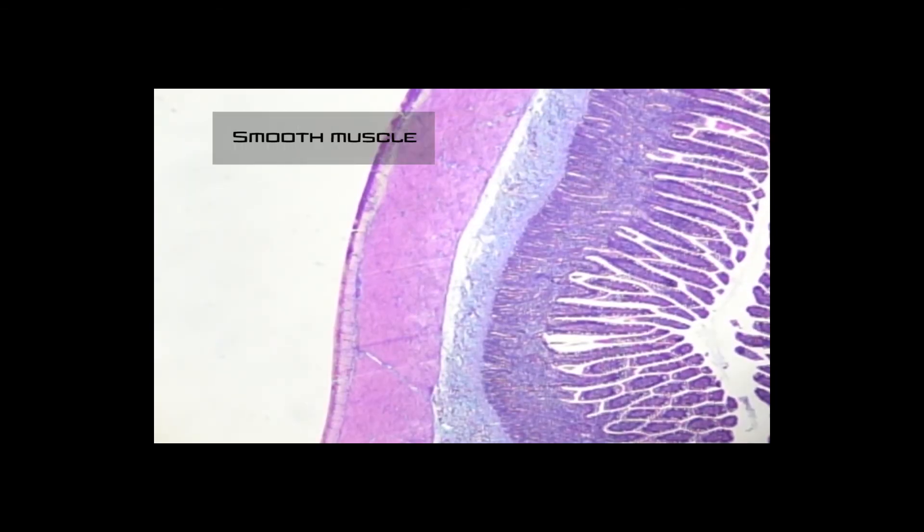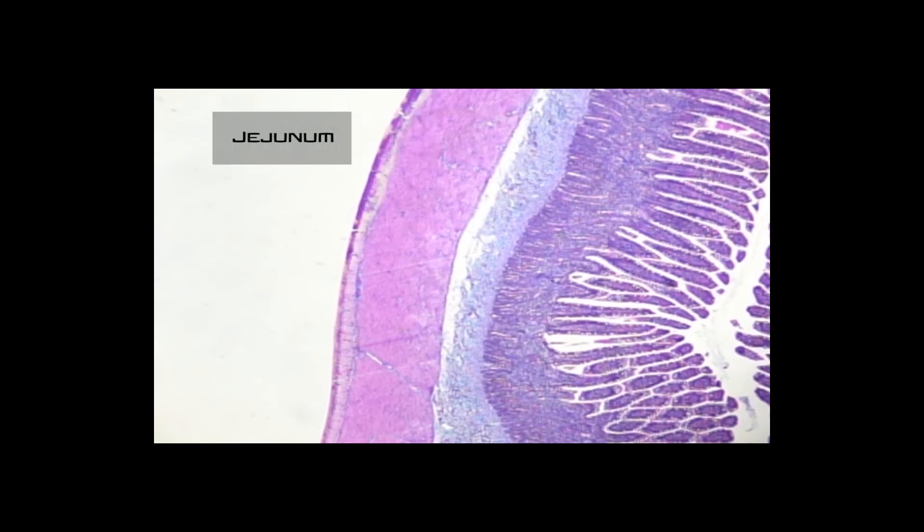So the next slide we're going to look at is smooth muscle. To see smooth muscle, we're going to go back to the jejunum slide. And if you remember, jejunum was our example for simple columnar epithelial tissue. So to find the smooth muscle, we need to go to one of these outer layers out here. And all this smooth muscle is going to help the organ work. So specifically for the jejunum, it's going to help move food down the small intestine.